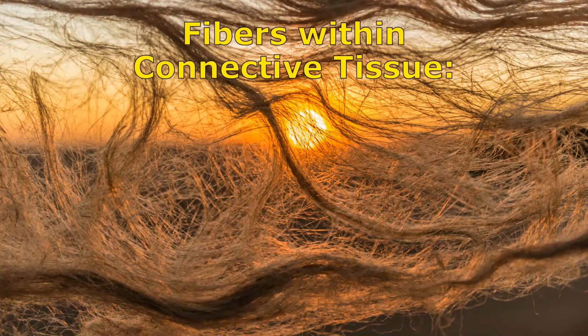Some fiber types that you might find within connective tissue. Again, you're going to see some ground substance. You're going to see some matrix in between the cells. And if you see something that looks like hair, it kind of is, but it isn't. They're called fibers. So let's look at the main fiber types you'll find here.